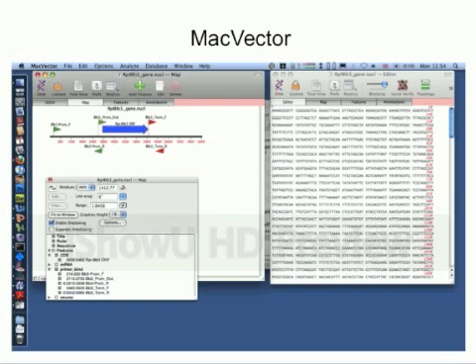And there's another program that I use quite often, MacVector. Some of you might have used Vector NTI. Anybody use Vector NTI? Okay, Vector NTI is the program to draw vectors and make constructs and do in silico Gateway cloning and stuff. And MacVector does the same thing. Well, with Vector NTI, they stopped making a program for Mac, so current Mac OS cannot run Vector NTI anymore. So we use MacVector a lot.